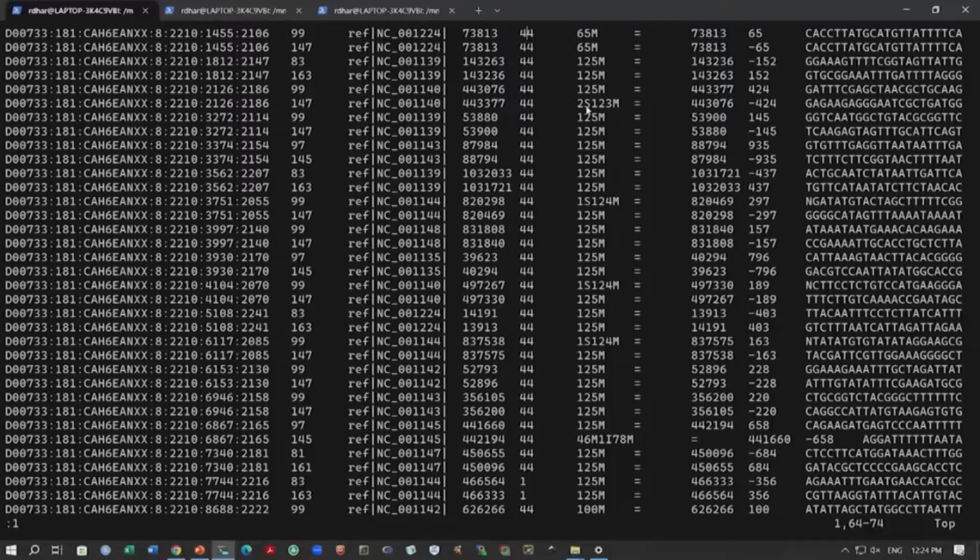These 2S or S will appear if you are going for local alignment. You will see a lot of these S signs, meaning there will be a lot of soft clipping, because you are going for local alignment. You can continue and interpret this one, 1S 124M. It means the first base is soft clipped, then the next 124 bases have been aligned. Okay. So, I think this is clear now.